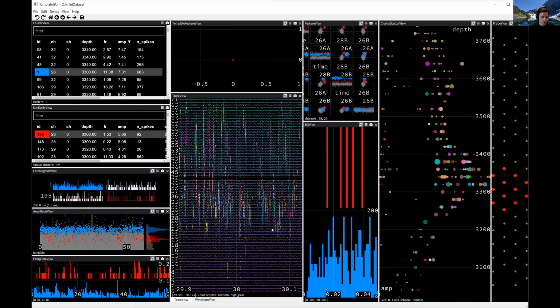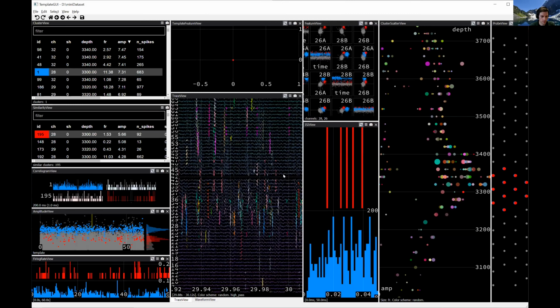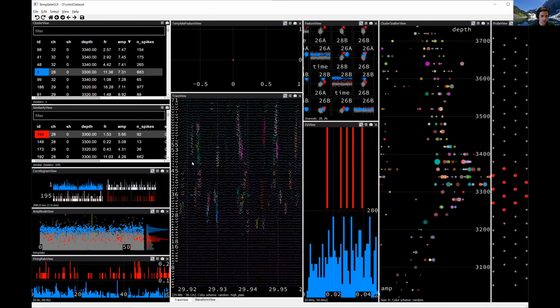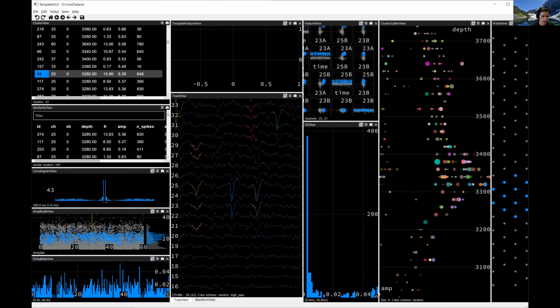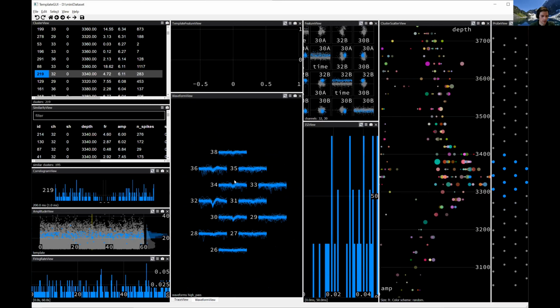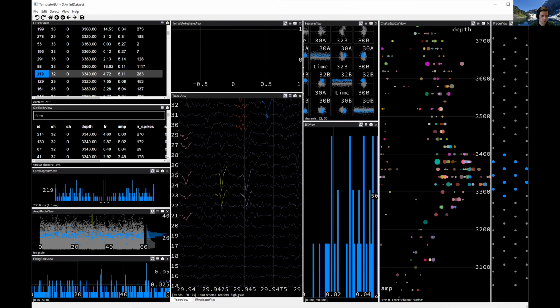Okay, hiding behind here, I have trace view. This is plots of your actual raw data. Again, this is right clicking and dragging around. You can get a view of your raw data traces and where it's found spikes. And one nice thing you can do on this view, if you're looking through here and you see some neuron that you want to investigate more, like maybe this neuron, you can actually, I think it's control and then click, and now it's selected that one neuron. And so if I switch back to waveform view, this is the neuron that I've now selected from the trace view, and you can see it turned blue. So I can select that one instead. And now I've got a different neuron. So that's a pretty useful feature if you're investigating trace view and trying to figure out what's the deal with certain features that you see.